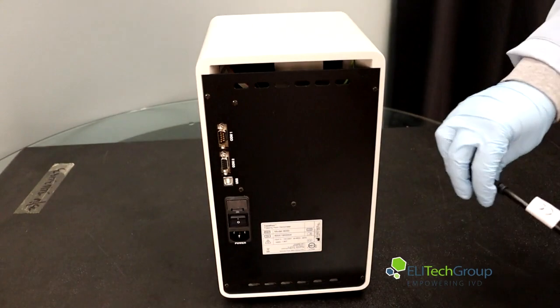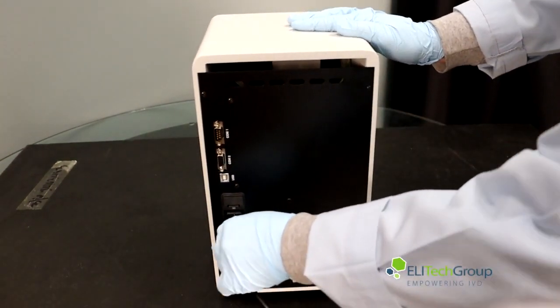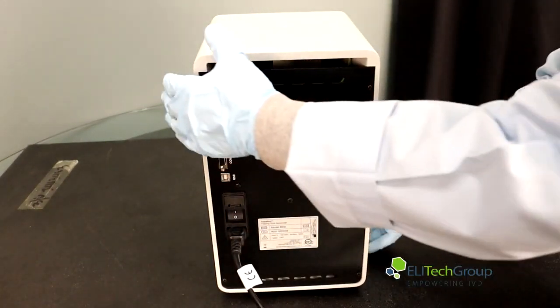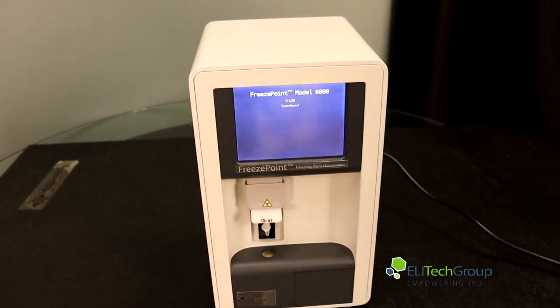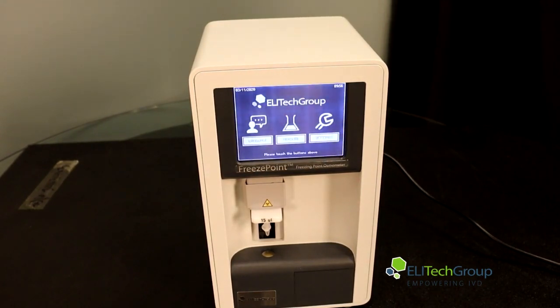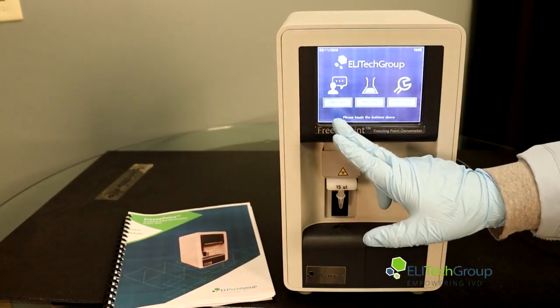To initially set it up, you will plug in your instrument here, you will flip the power on, and then you will get this screen.